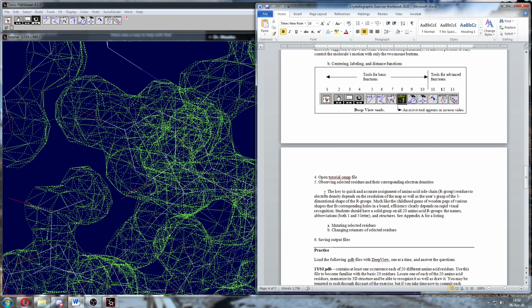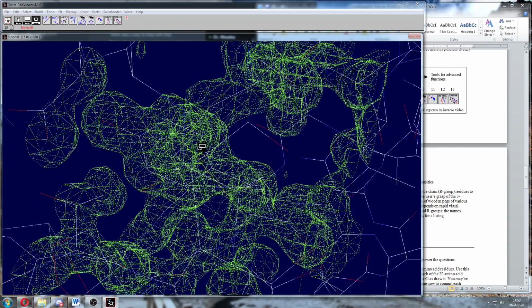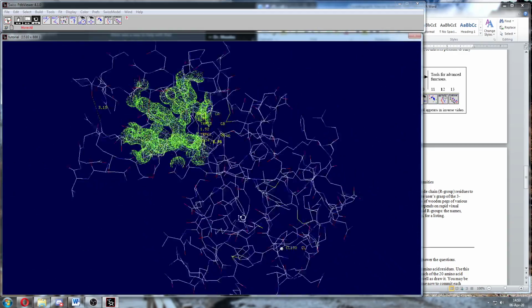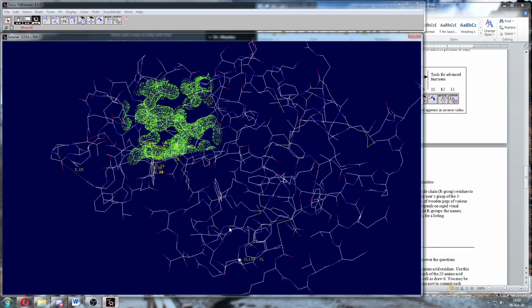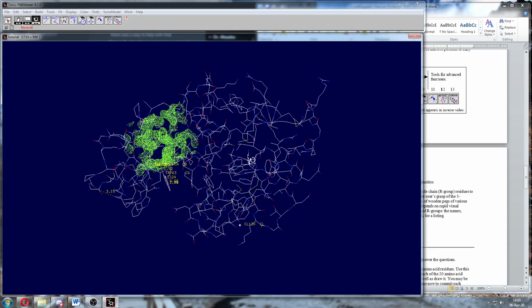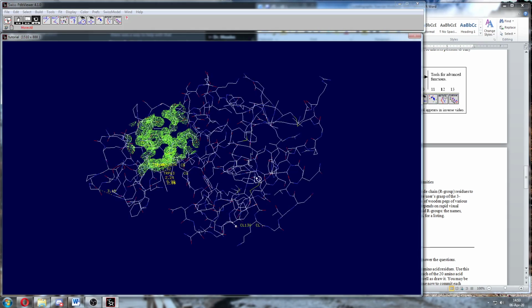Right? So if you're doing this with me, or if you're doing this on your own, you can pause the video and watch it later and pick up. And if you're watching this later, I want you to pause it and try doing this. There's 20 amino acids in the structure. This took a while to find back in, I don't remember when I did this, early 2000s, late 90s, somewhere around there. Right? So all 20 amino acids are represented in the structure. It's easy to find today with the hundreds of thousands of structures deposited, but back then it was not.